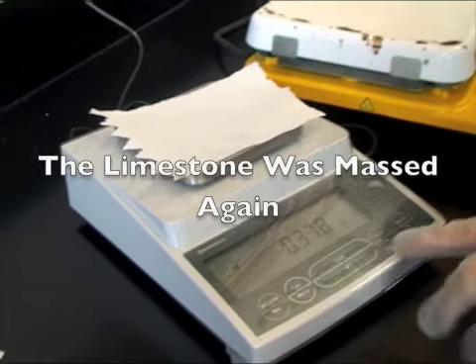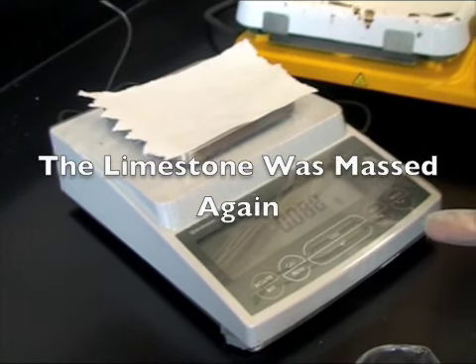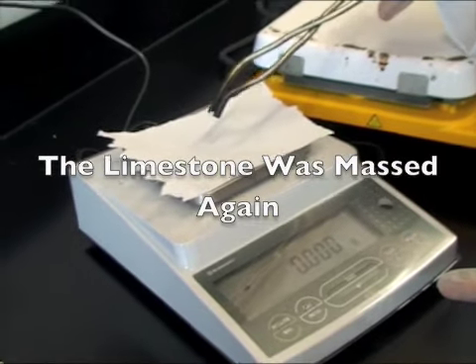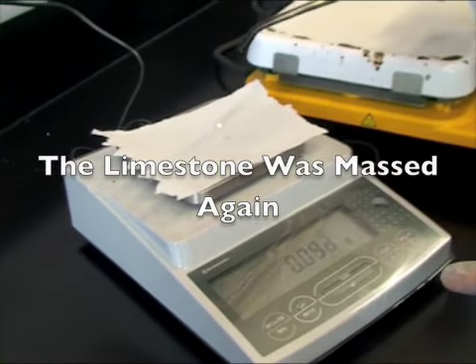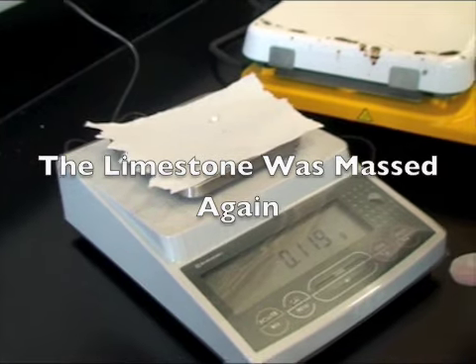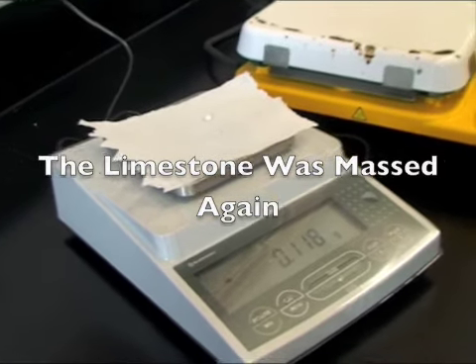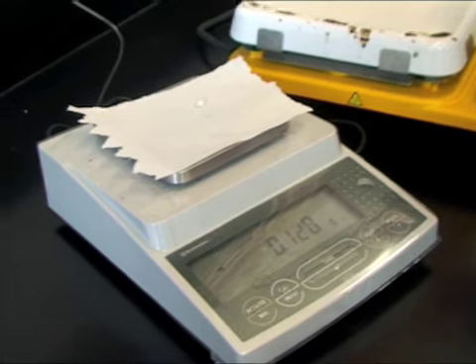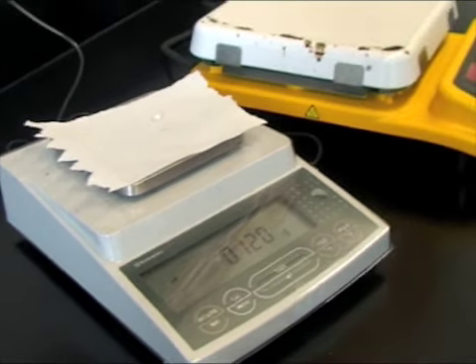The limestone was massed again after the reaction, and we compared it to its mass before the reaction. The water limestone decreased in 1/1000th of a gram, and the limestone that was placed in acid decreased in 5/1000ths of a gram.